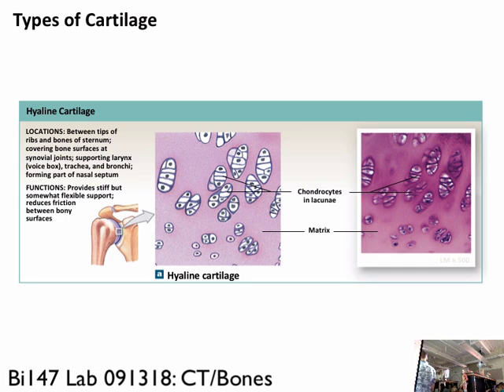Okay. Next, hyaline cartilage. So we've done 3, I'm going for the 4th. Now we're moving on to a different category of connective tissue. The next 3 slides, and there's only 3 left, are all types of what are called supportive connective tissue. Supportive connective tissue. And hyaline cartilage is one of them. It's called hyaline cartilage because it has this stuff called hyaluronic acid.